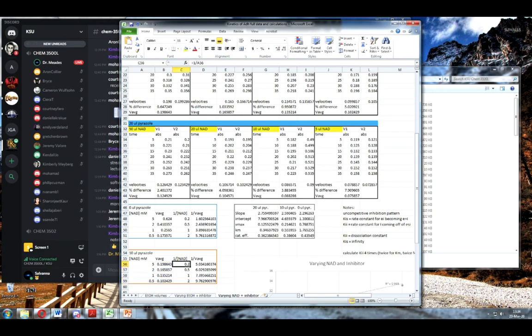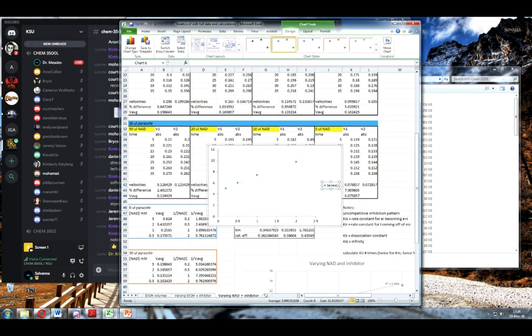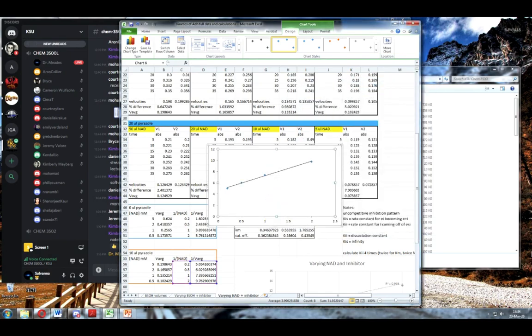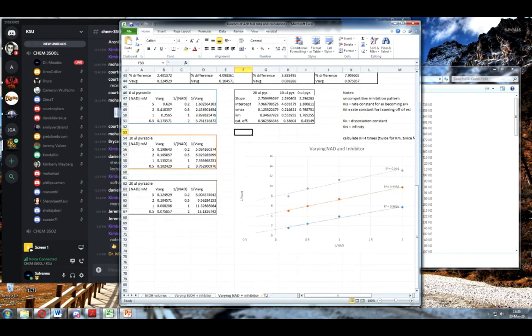And if I plot them the other way, reciprocals, that should get a straight line. Does any point look like it's not on a straight line? The trend line should help you see it. It's a little bit off. Which one? The last one again. These three line up perfectly, but the one out here is again a bit low. If it were a little higher, which tells me again, like I said on the first one, it's a little too fast. And then if we plot all three of those on the same graph, we get something like this.